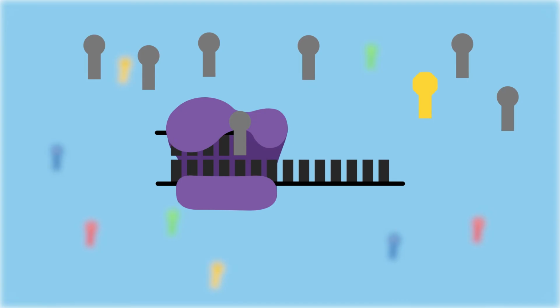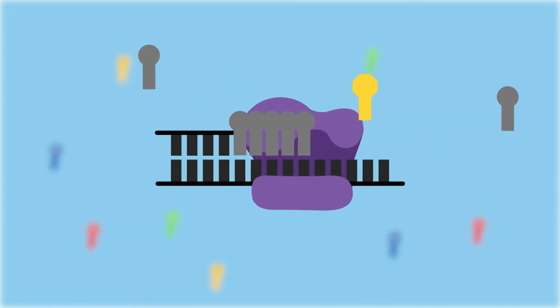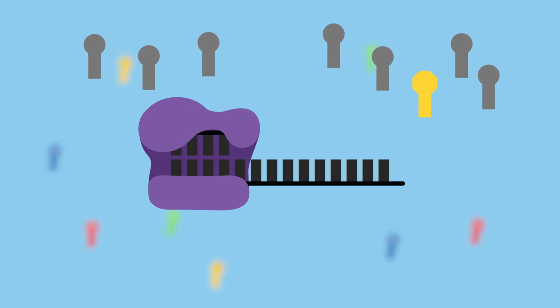The DNA polymerase does its job in elongating the complementary strand using the 4 deoxynucleotides. Then suddenly, a dideoxynucleotide gets picked up by the polymerase and incorporated into the strand instead. Because there's a hydroxyl group missing on that last dideoxynucleotide, the phosphate group from any incoming deoxynucleotide can't form a bond, so elongation for this strand is thus terminated. This is why Sanger sequencing is also called the chain termination method.